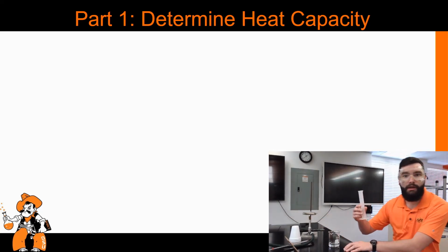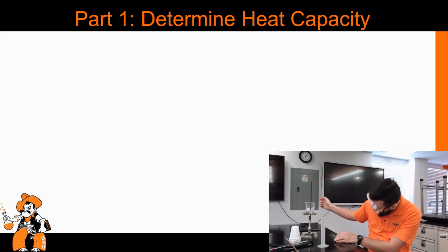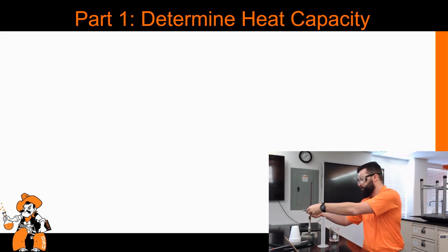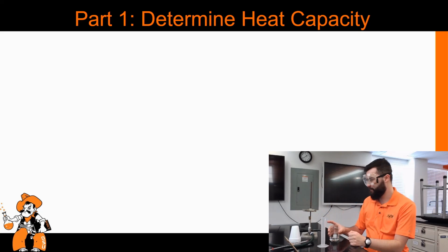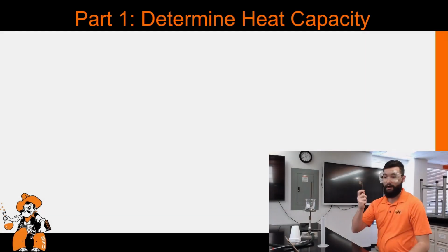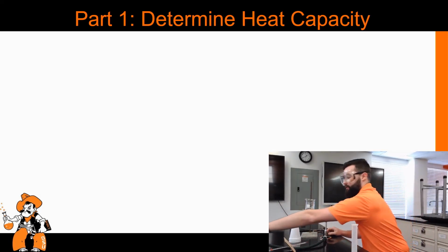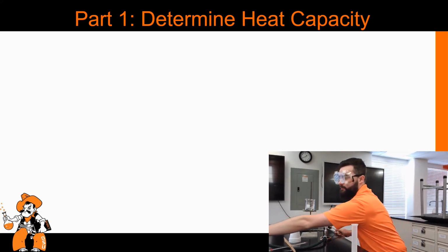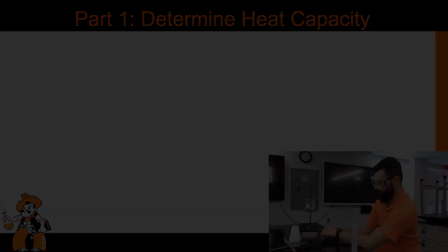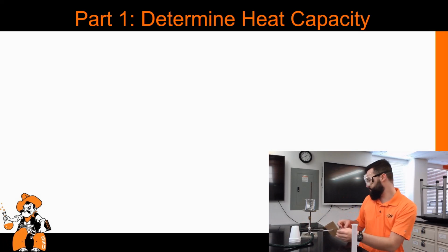Okay, so I just added my water here. I'm going to go ahead, get my Bunsen burner going. That is entirely too low, so I'm going to raise this up a hair. And I have no striker. Alright, so I'm back with my striker now. Okay, so I'm going to go ahead, get my Bunsen burner going. We are up to 60 degrees Celsius.